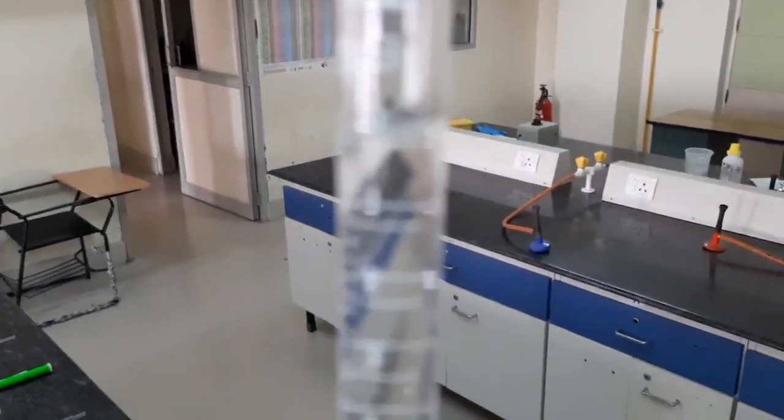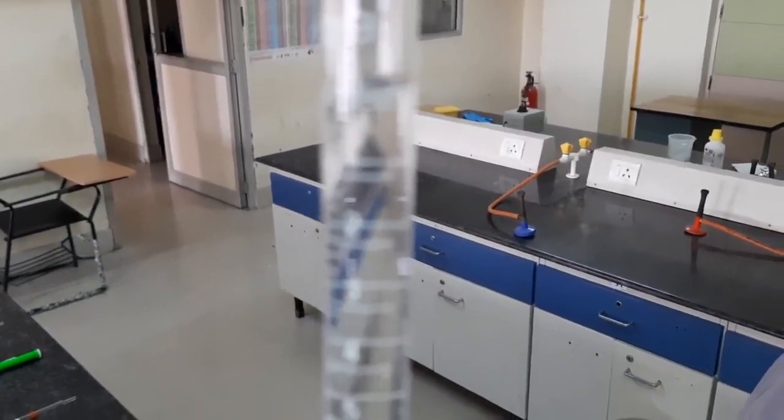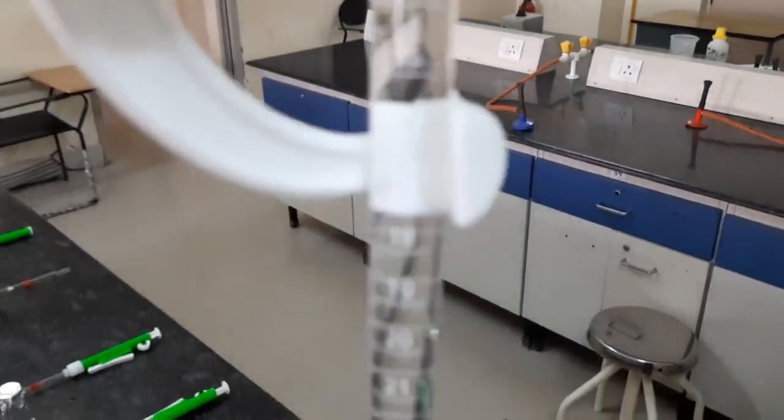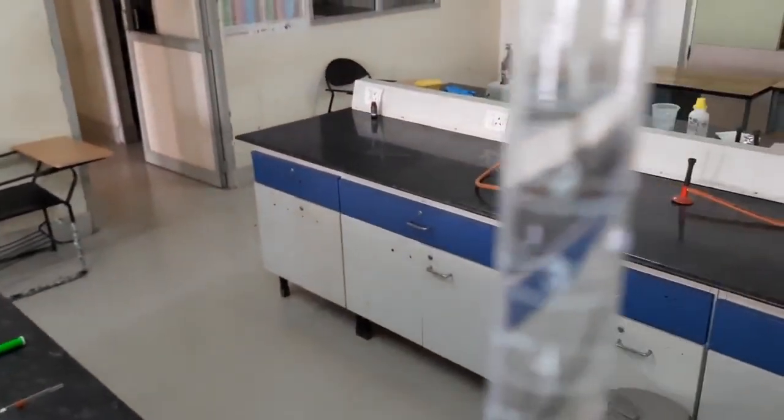Ensure that the burette is completely and neatly filled, and see that the initial reading is set.